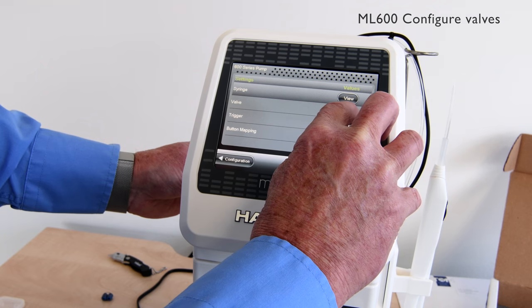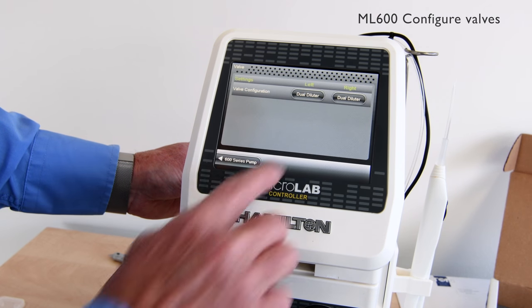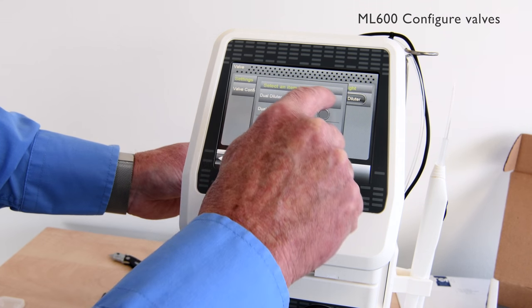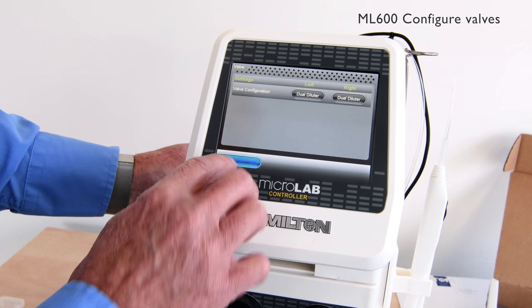Here we're going to select the valve configuration we require. In this case we're going to select the dual diluter format. Other options we can choose are dual dispenser and continuous dispenser formats.